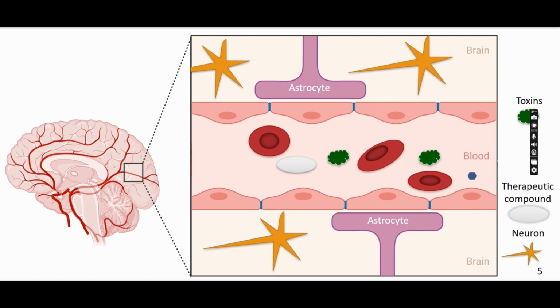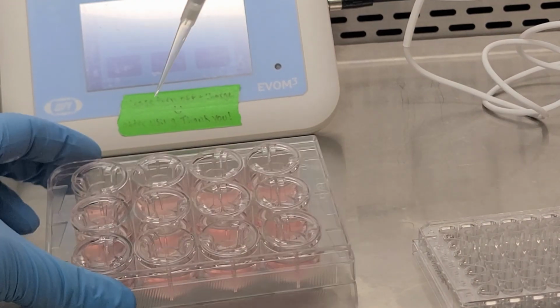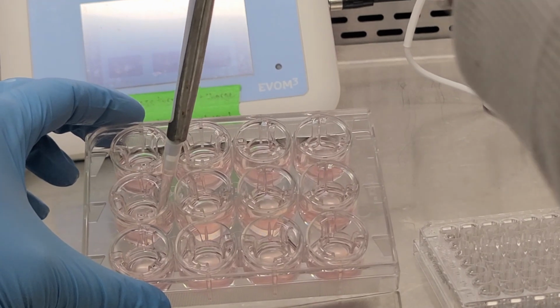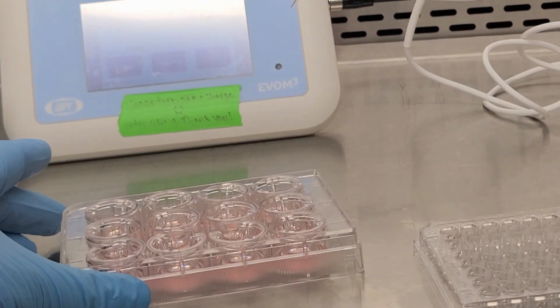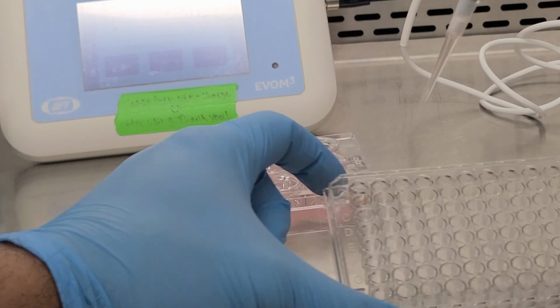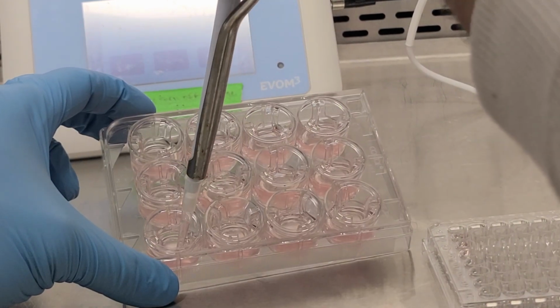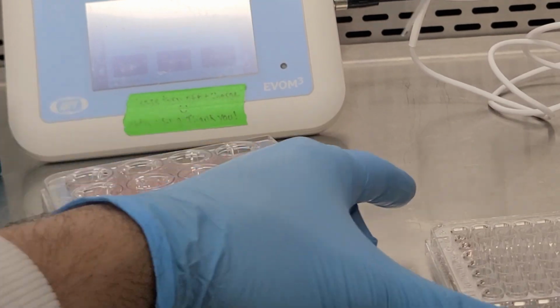And so my project actually involves both of those contexts in another disease that I'm interested in, and that's what I'm studying today. I am trying to determine whether the disease model has a difference in barrier function compared to the control. After I finished measuring TEER, I started taking samples for metabolite measurements. I'm specifically interested in the concentration of metabolites in the top and bottom of these transwells. I'm trying to understand how metabolite transport and utilization changes in the disease model.